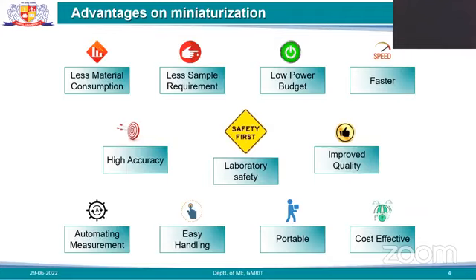And when you come to laboratory safety, obviously the safety of those who are working there is a very necessary thing. As the requirement of the sample is less, in a similar way the requirement of the corresponding chemical will be less.